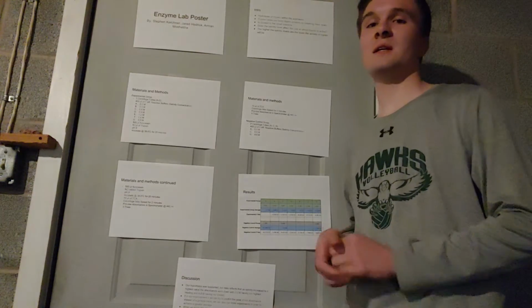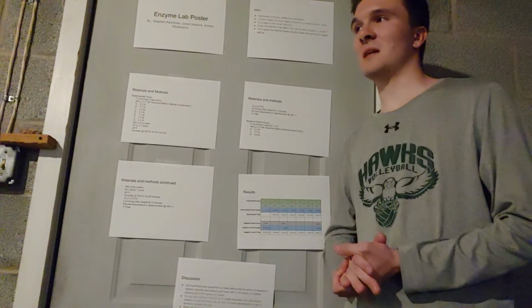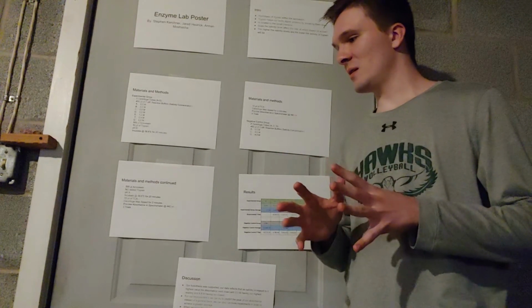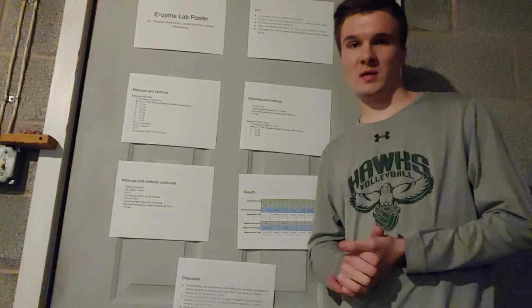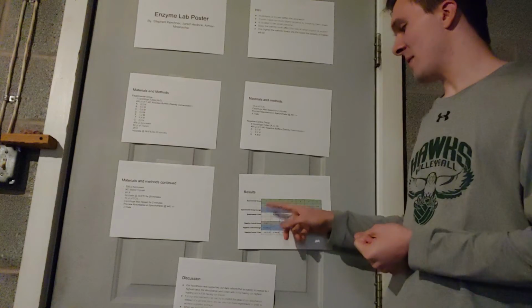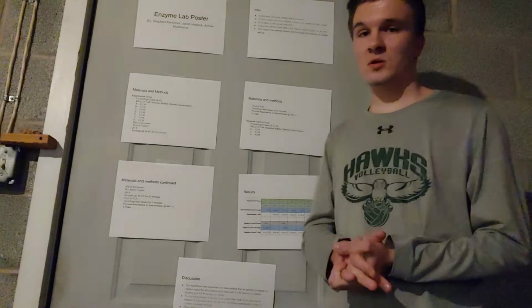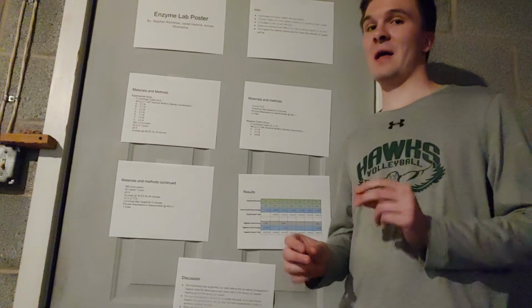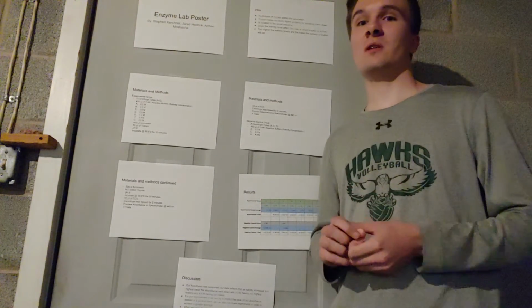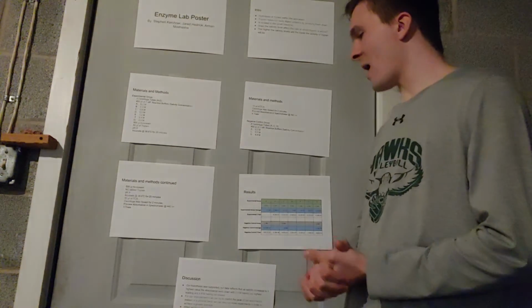However, we feel like we can take it a step further in saying that there will be a general trend, that we can narrowly cut down to what the ideal environment for the trypsin would be as far as salinity goes. So we see the peak at 0, and then it goes down, and then it comes back up. Roughly in between 0.9 and 1.2 is where it starts to drop off again. So we believe there might be another peak in between there. We had to put 0.6 and 1.2 to get to the 0.9. So maybe putting 0.6 and 0.9 together to get the number in the middle of that could produce an ideal environment. As well as doing more trials.